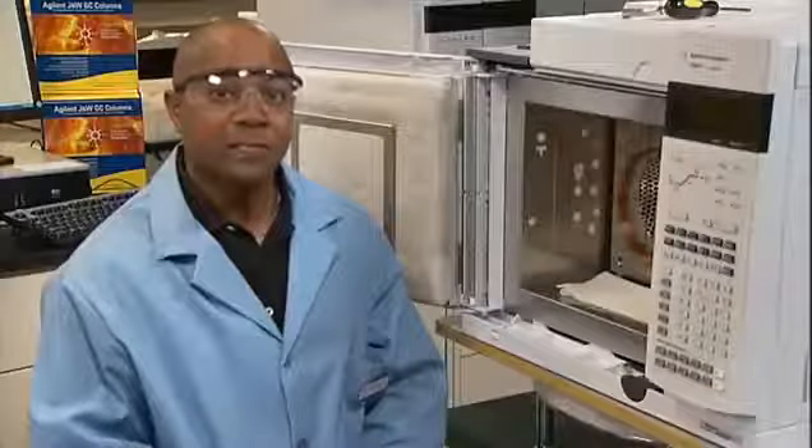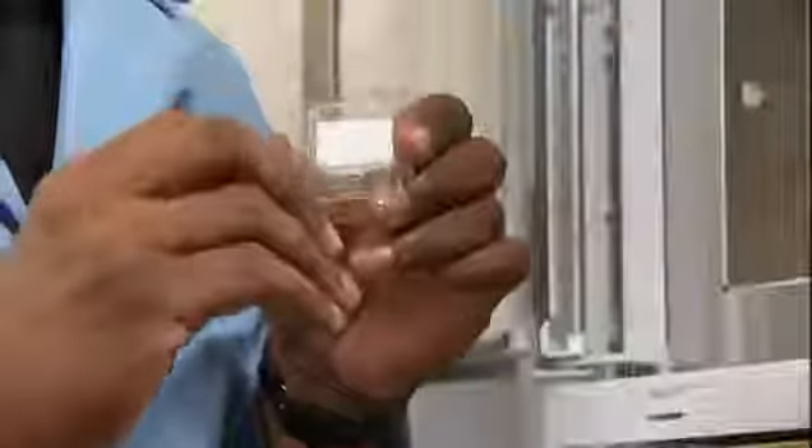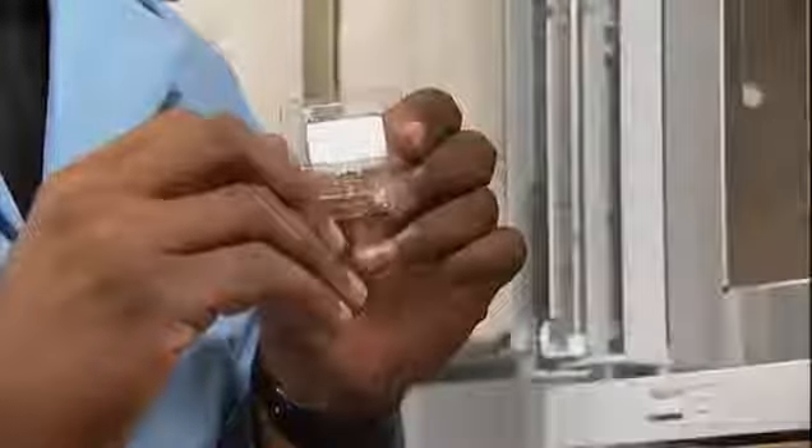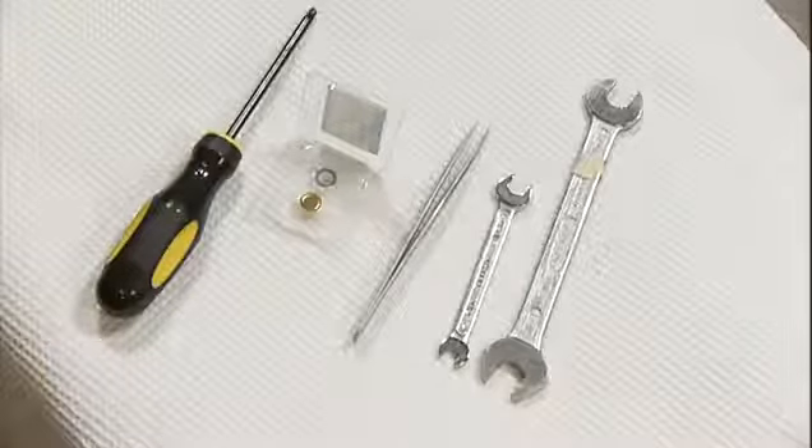For parts, you'll need the seal replacement kit — the one with the stainless steel washer. For tools, you'll need one quarter inch and one half inch opening wrench. During the procedure, avoid handling the seals with your bare hands. Oil from your skin can cause extra peaks on your chromatogram.